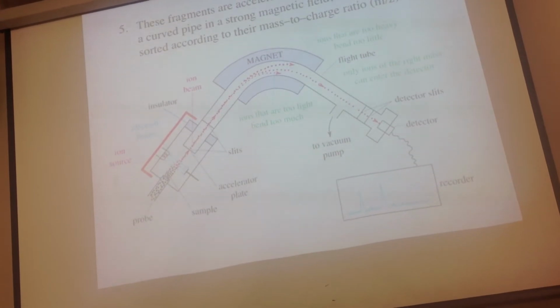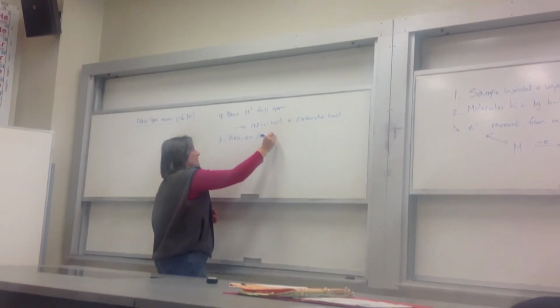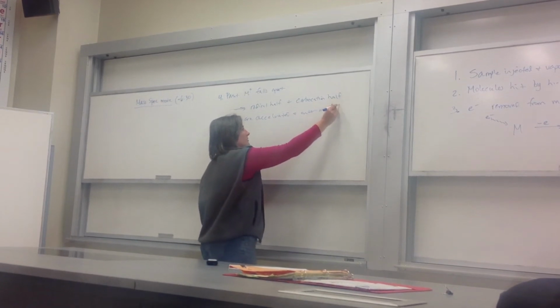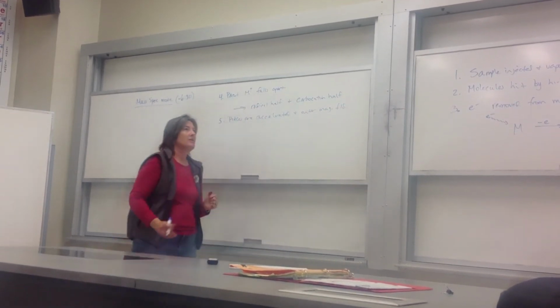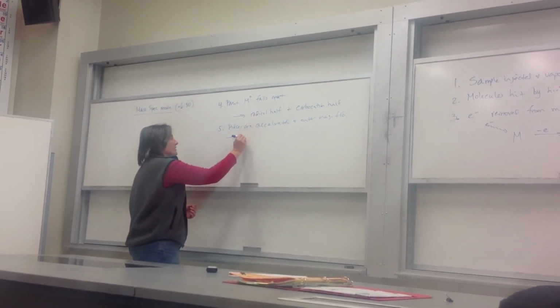So we've got these pieces. Pieces are accelerated and enter a magnetic field. And here is where they get deflected.